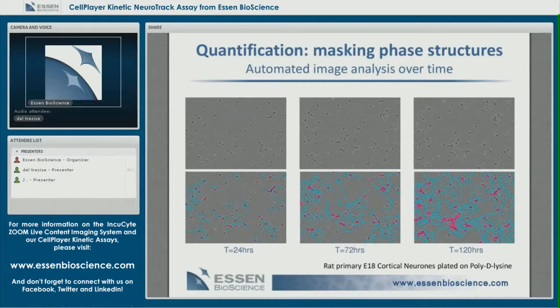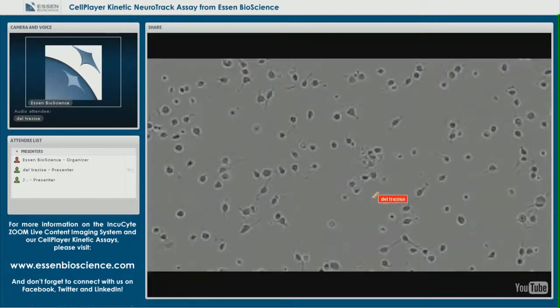So you can see clearly here, as a function of time, these cells send out neurite projections and develop, after 5 days, a fairly elaborate neurite network. It's a little easier to see that if I show you a movie, so let's just jump out of the PowerPoint for a second. Just a reminder, for those of you who can see my mouse here, if you'd like to see this movie as best as you can, select your maximal resolution, the highest number here, 720p.